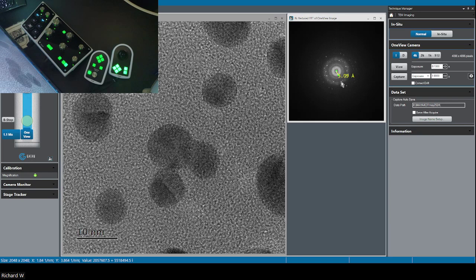So I think angle 1 is the best for this microscope, and that gives you a better beam condition for the high resolution TEM. It doesn't affect the resolution, but what it does affect is the contrast.